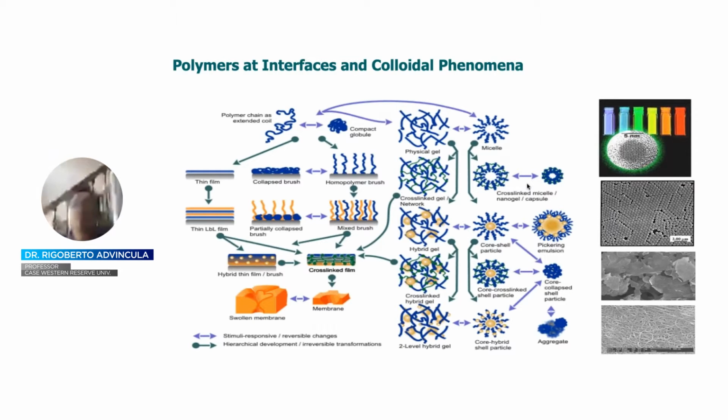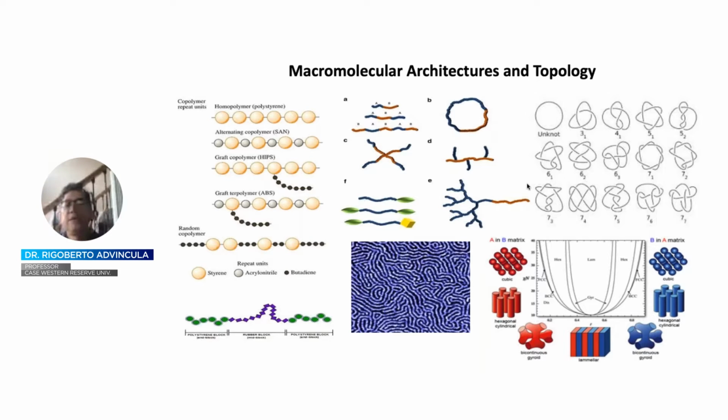Now, what is of interest to some of you perhaps is in the area of synthesis, where you are interested in the sequence of monomers, topology, block copolymers that influence their morphology at surfaces. So-called AFM, TEM are great microscopy techniques to investigate this morphology that is influenced by the architecture, topology, or even composition of the polymer. So macromolecular architectures are very important. The question really is, how do we end up with precise structures that we design perhaps on paper and end up with a polymer that we can study or investigate using these state-of-the-art techniques.